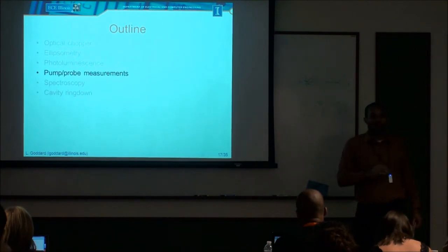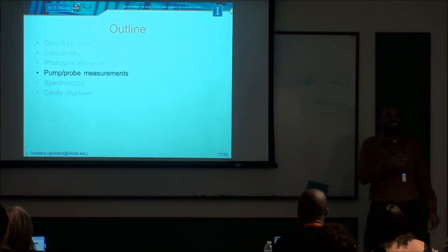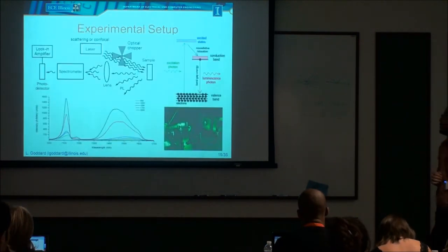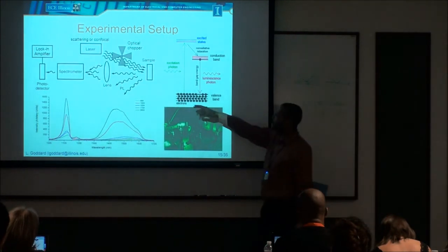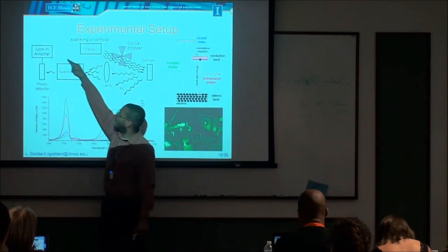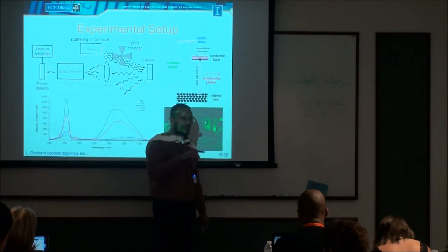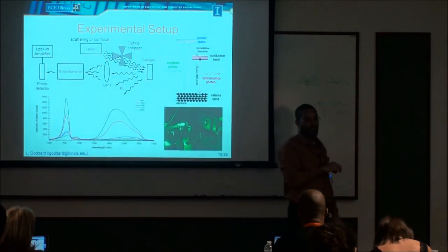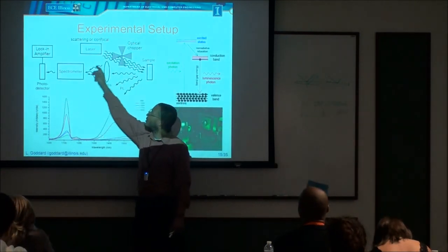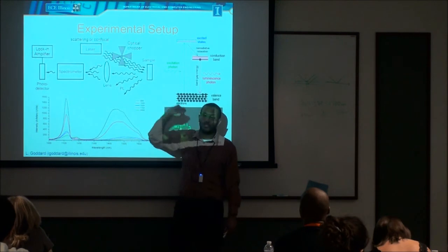Okay, questions about photoluminescence? Yeah. As a reference frequency for your lock-in amplifier, you would use the frequency of the chopper? Yes, so you would chop at 1 kilohertz, and the chopper, I didn't show it, has an electrical signal that connects to the lock-in amplifier. So you have a square wave reference signal going to the lock-in amplifier. Your photodetector here is going to see a square wave signal based on the fact that you're chopping it.